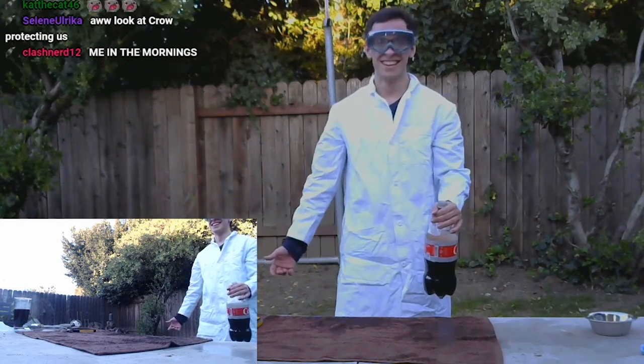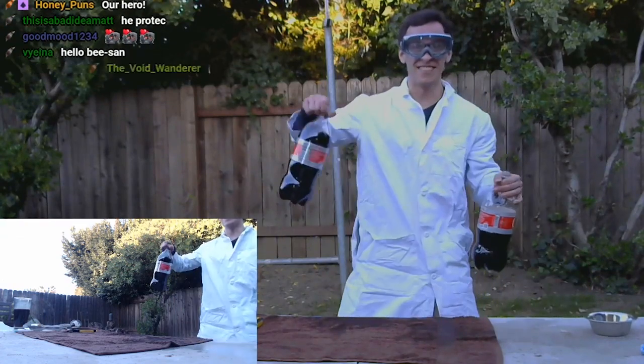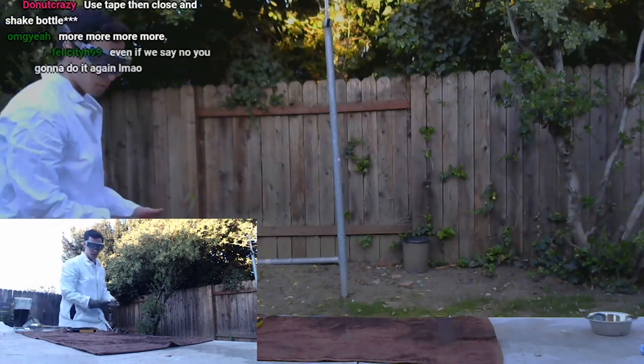That was about to hit you guys! You want to do it again? Got to do it really fast because — oh, we got a crystal, guys! We got a crystal! Ladies and gentlemen, we have a crystal!